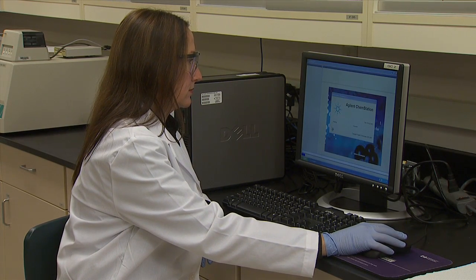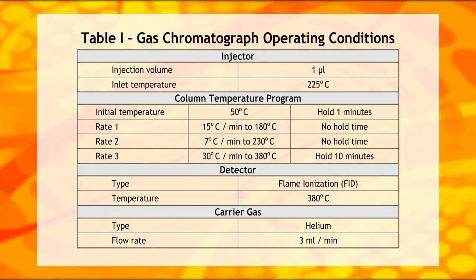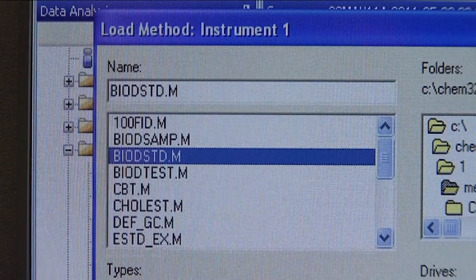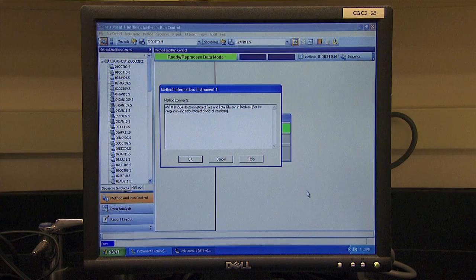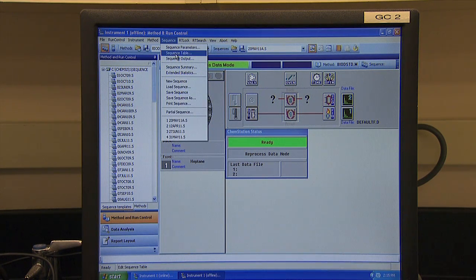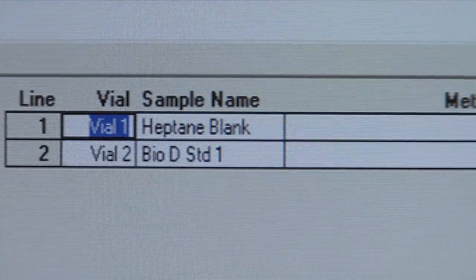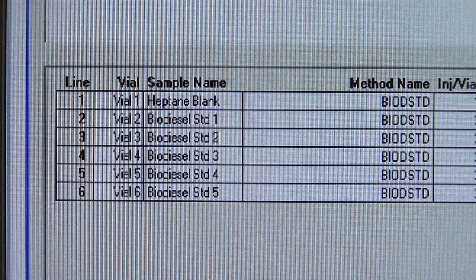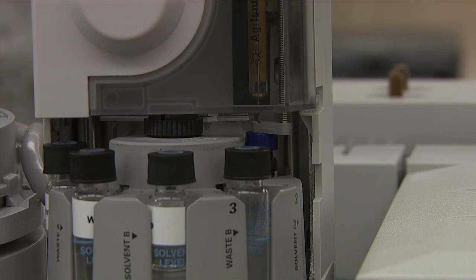To analyze the standards by gas chromatography, load a GC test method that contains all of the test parameters listed in Table 1. Ideally, there should be two separate instrument methods — one for standards and one for samples. The instrument settings will be identical, but the integration events will vary after injections have occurred and chromatographic parameters are fine-tuned. After loading the GC method, build a sequence table to include at least one solvent injection such as normal heptane as a blank. This blank run provides a chromatographic baseline. In the sequence table after the blank, add the first set of injections for the five standards. Specify the injection volume of one microliter. Each of the five standard solutions will be injected three times, and an average of the three injections will be used for the calibration curve calculations.